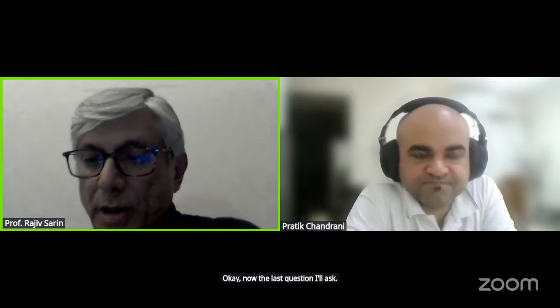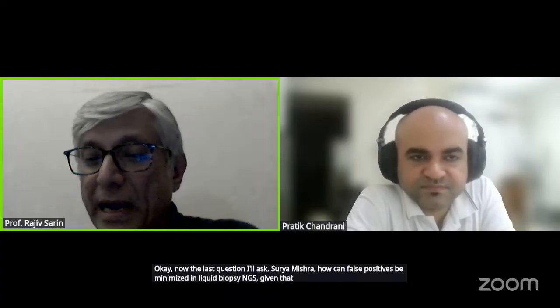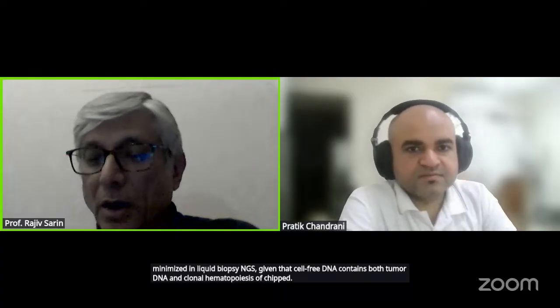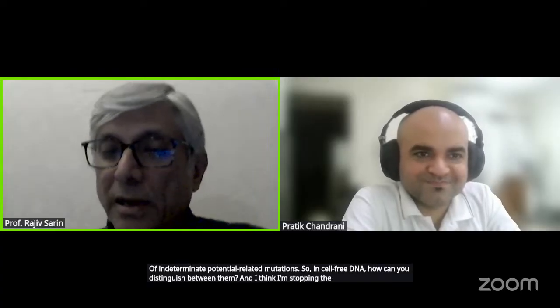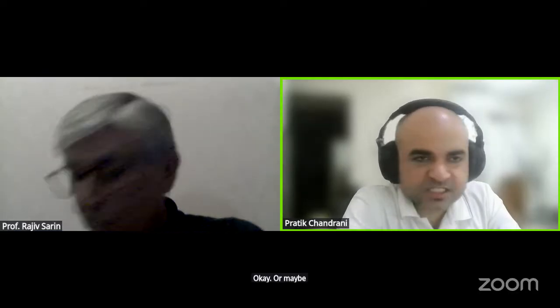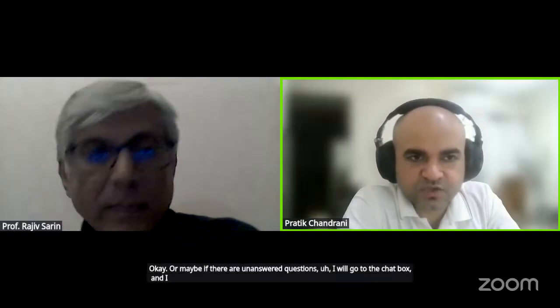Okay, now the last question I'll ask, Surya Mishra: how can false positives be minimized in liquid biopsy NGS, given that cell-free DNA contains both tumor DNA and clonal hematopoiesis of indeterminate potential (CHIP) related mutations? So in cell-free DNA, how can you distinguish between them? And I think I am stopping the questions now, they are still coming. Or maybe if there are unanswered questions, I will go to the chat box and put the answer over there if anything is missed out.